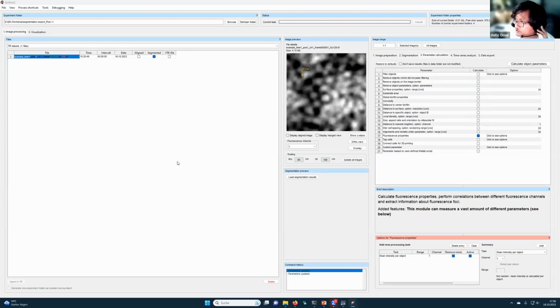But you do have a segmentation part in BiofilmQ? You don't have it, so you do need Napari? Exactly. Napari or whichever tool you want to use that is very good for your data set, you can segment.